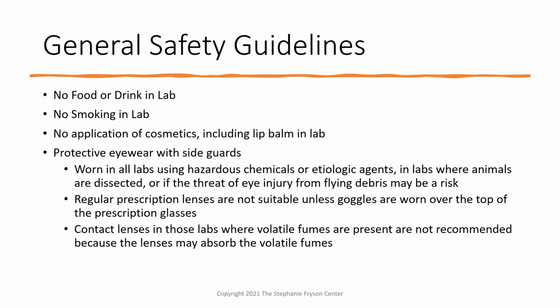For those of you who are working in labs and dealing with COVID-19, remember you have to have on face shields and face mask while you are facing patients. Protective eyewear is worn in all labs using hazardous chemicals. Regular prescription lenses are not suitable unless goggles are worn over the top of the prescription glasses. That's very important. That has come up as a question recently. Contact lenses in those labs where volatile fumes are present are not recommended because the lenses may absorb the volatile fumes.